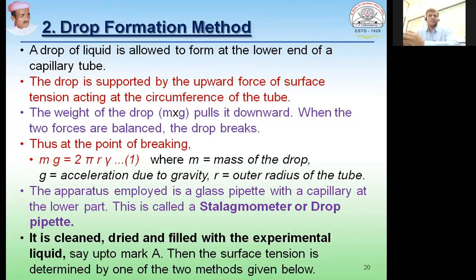So let us discuss both these methods, which work on the principle of the drop formation method. In both techniques, the stalagmometer is the glass apparatus which is used.